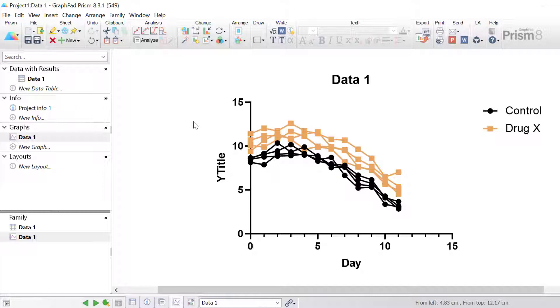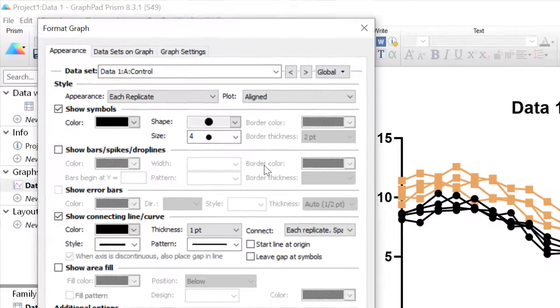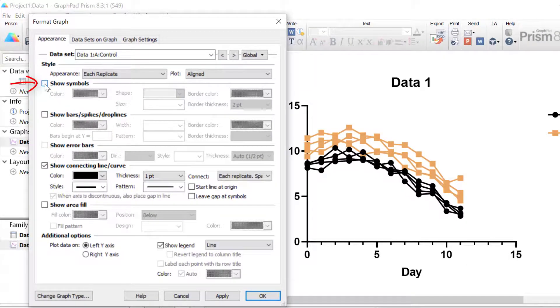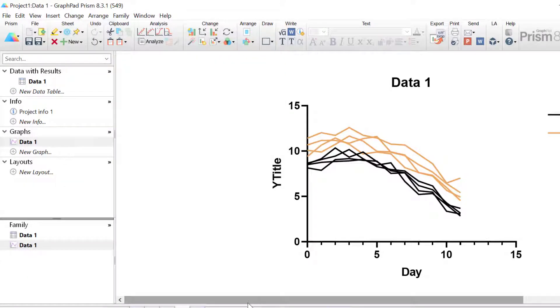Next, notice that there are symbols shown for each data point. Usually spaghetti plots do not have symbols shown on the lines, so let's remove these. To remove the symbols I will go to the format graph button at the top and simply untick the option to show symbols. I've done this for the control group, and I'll quickly toggle to my next group drug X and do the same thing, then click the OK button.